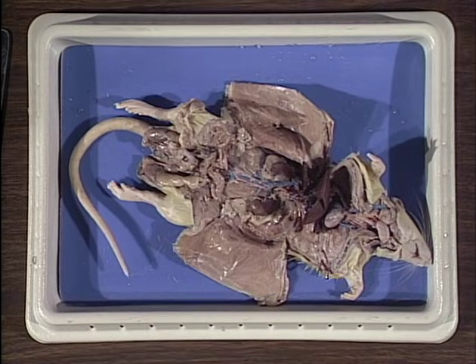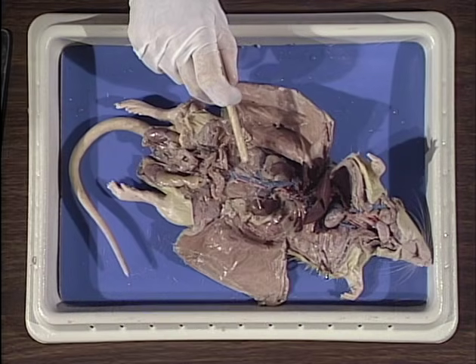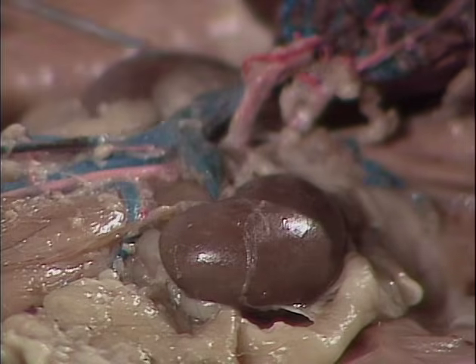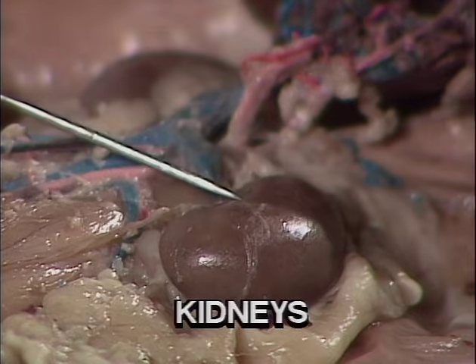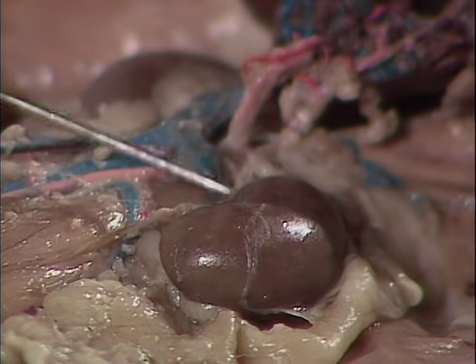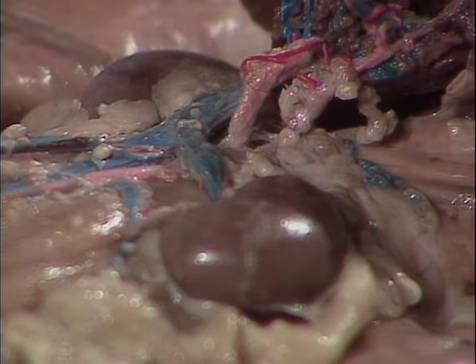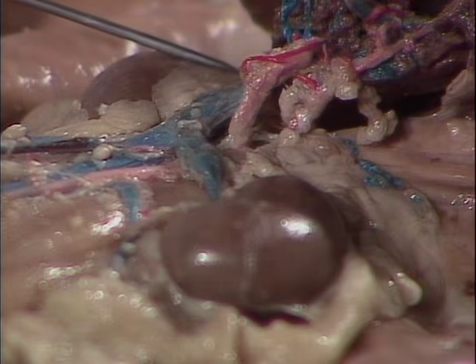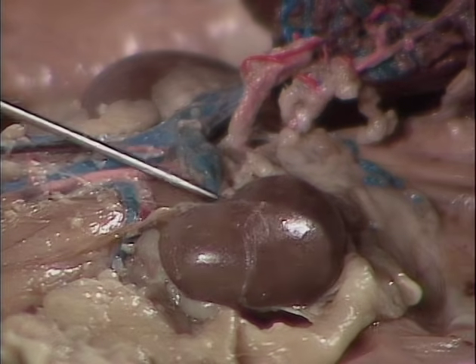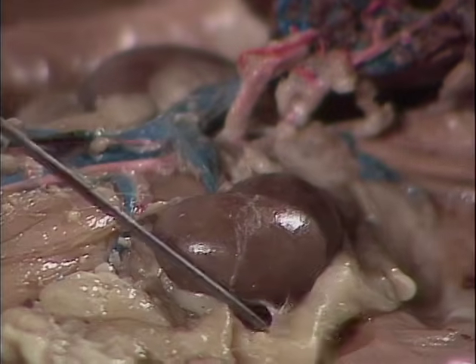The excretory and the reproductive systems are closely linked and are often referred to as the urogenital system. The 2 bean-shaped structures we see here are the kidneys. They are the principal organs of excretion in the rat. They are located in the mid-dorsal section of the abdominal cavity. Usually, the right one is a little bit elevated compared to the left one. The kidneys are embedded in a fatty material.